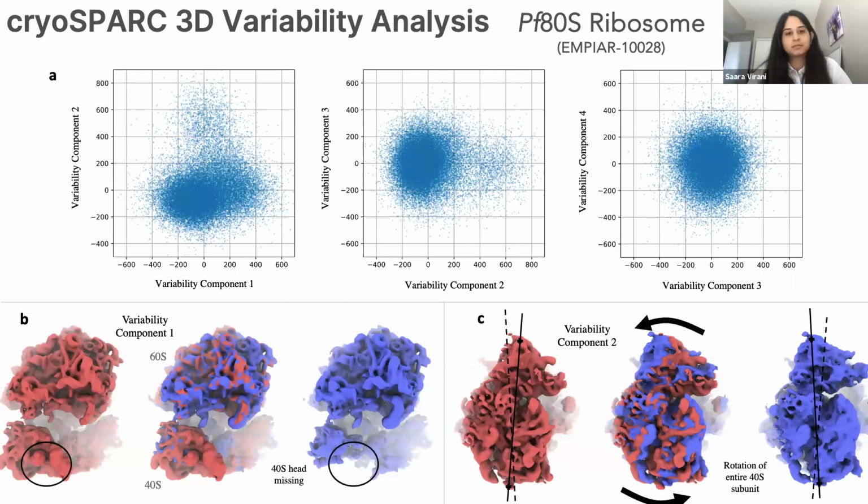I think so. Yeah, I'm not too sure in terms of the sample preparation and the amount of motion that is plausible at the temperatures where the sample is stored, like in terms of motion of a given particle while it's being imaged. I'm not sure about that, but thermal motion of the particles is probably definitely responsible for all the variability that we see.